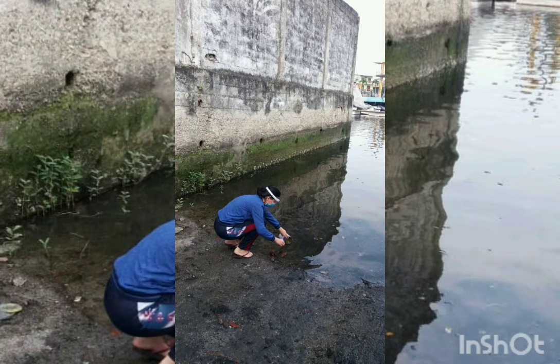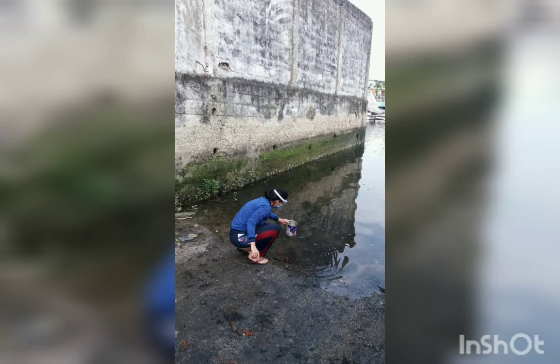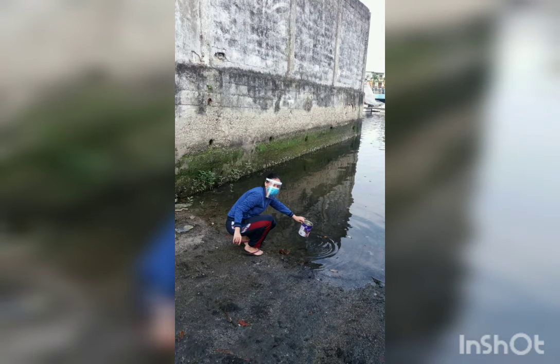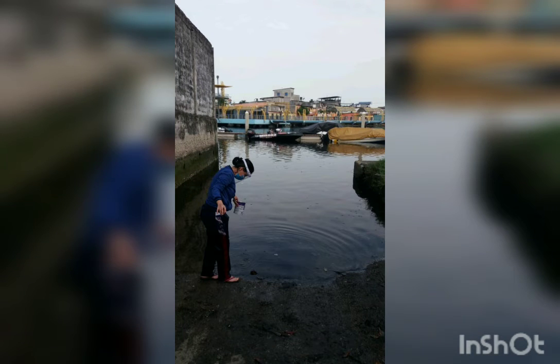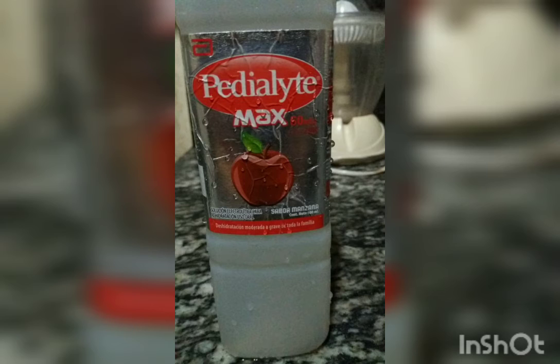Because of force majeure, when collecting water, and with evidence from certain studies that river waters have the COVID-19 virus, at the time of collecting water, efforts were made to take the biosafety measures recommended by the WHO. Also, take precautions with handling and performing the experiment at home. For the collection of the water sample, we make use of a container of which we know the contained volume, for practical purposes, to avoid measuring the volume mathematically.